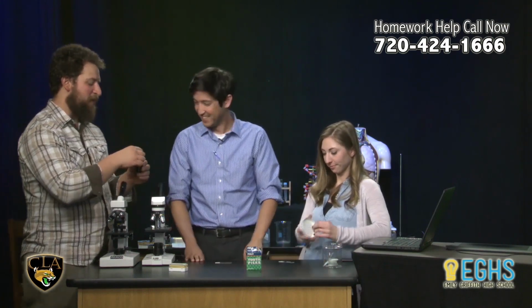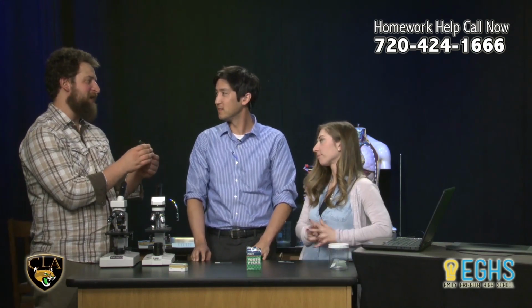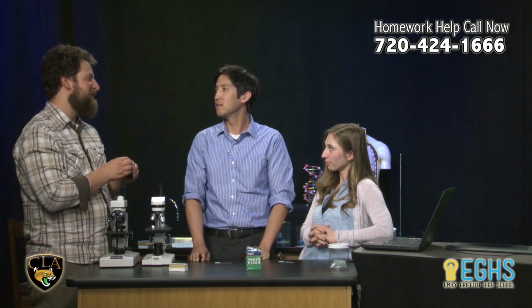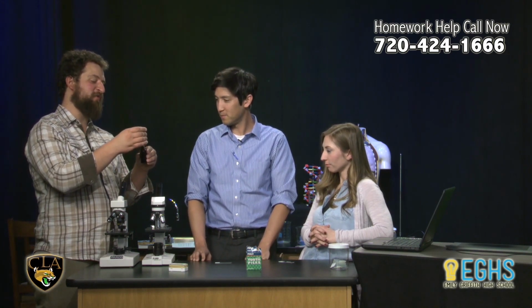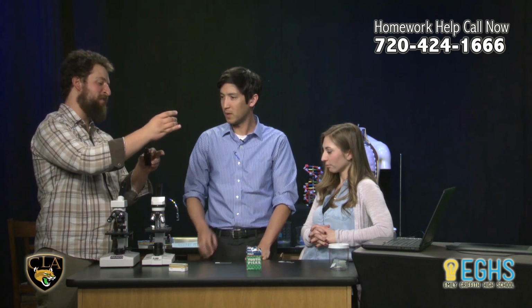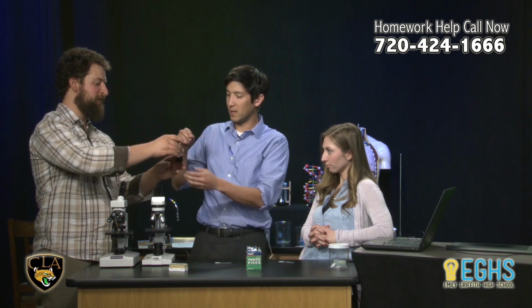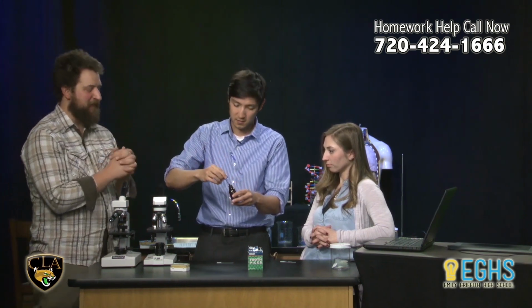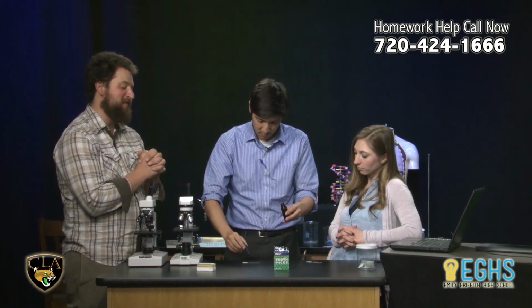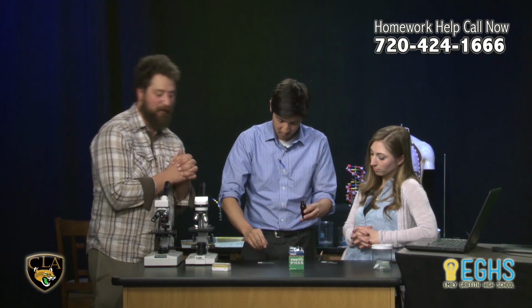So what I have here is methylene blue. This is a dye that we use to dye different specimens. If we were to look at our cheek cells plain, we wouldn't really be able to see them very well because they're largely translucent. So you can pull up a lot of this blue stuff here, but you really don't need much. You don't even need to touch this thing, just touch the end of the dropper to the center of your slide. Is this just, you said this is a dye, so it's not just food color? Or a stain, I should say. Yeah, it's a stain, a specimen stain for biological slides.